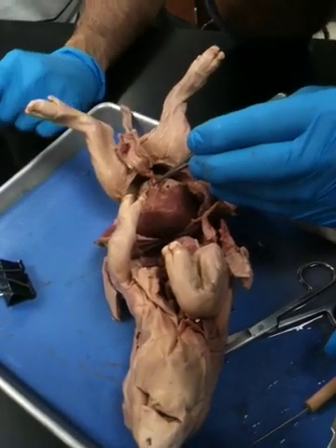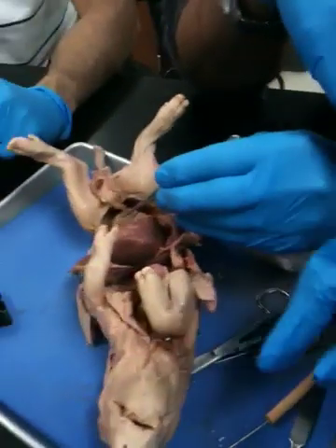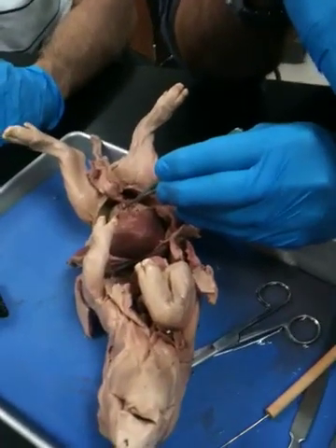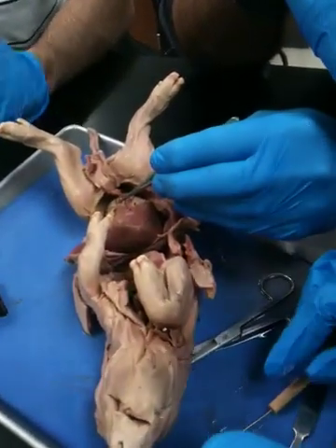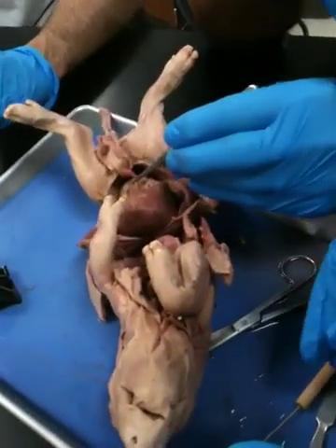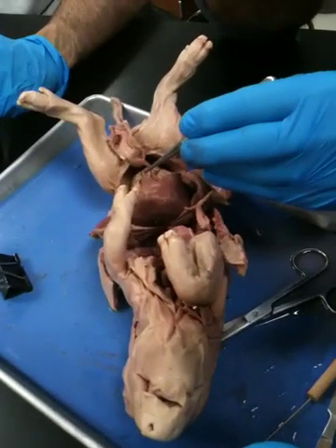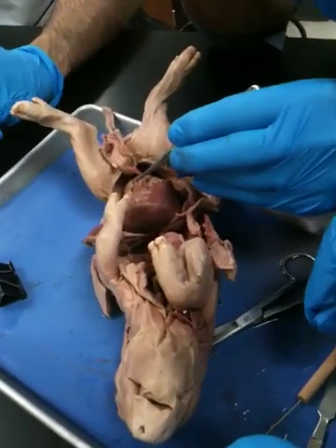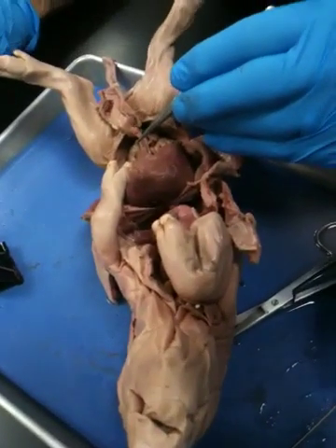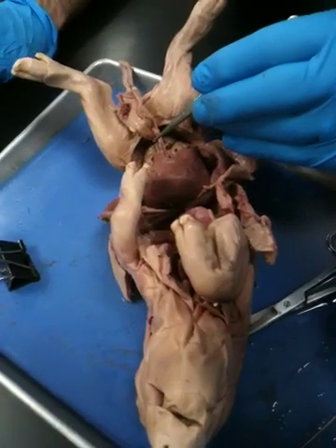Well, it turns into the round ligament afterwards. What's that word for round? Ligamentum rotundum. So what was it before it was cut? A blood vessel. What was it attached to? The umbilical cord. Therefore, the name would probably be... umbilical.